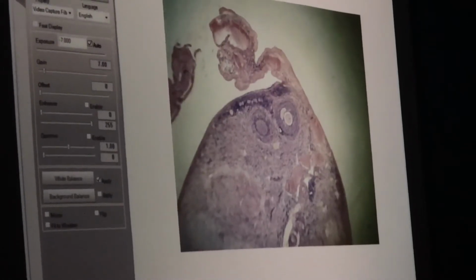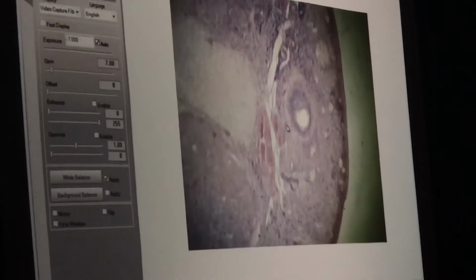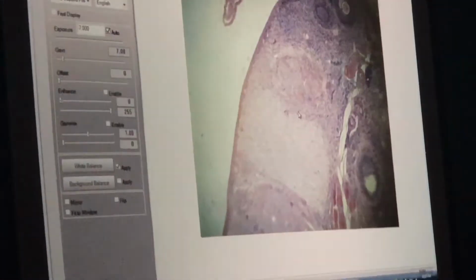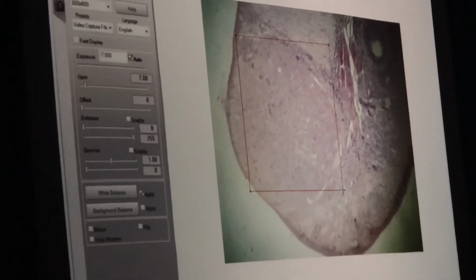Okay, if I go back to scanning power, I'm going to look for corpus luteum. So there are a bunch of primary and secondary follicles on here. I don't really see any tertiary ones because probably whatever I had for tertiary follicles ovulated, and probably the one that ovulated used to be right here. Do you see it?